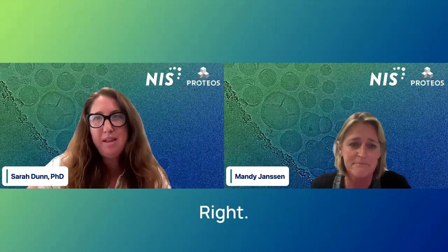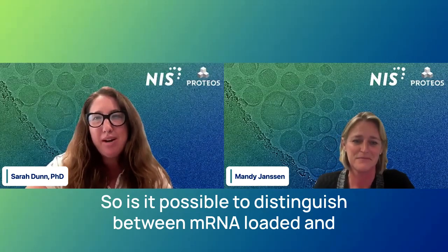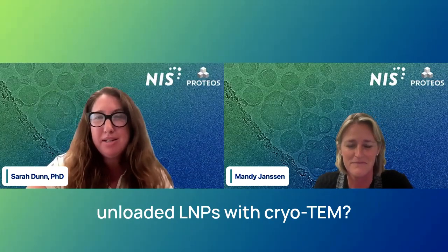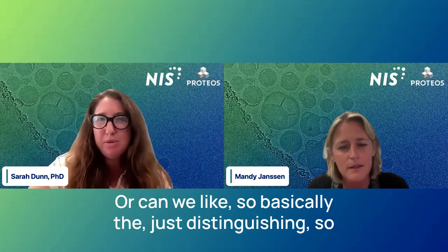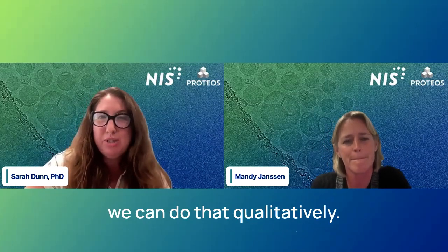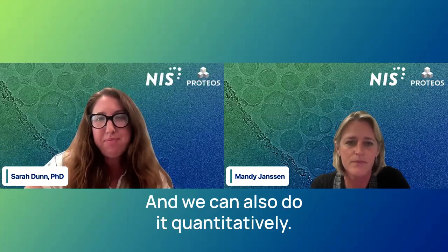Right. Continuing on with payloads of LNPs, is it possible to distinguish between mRNA loaded and unloaded LNPs with cryo-TEM? That's about the same question, right? Basically, just distinguishing, we can do that qualitatively, and we can also do it quantitatively.